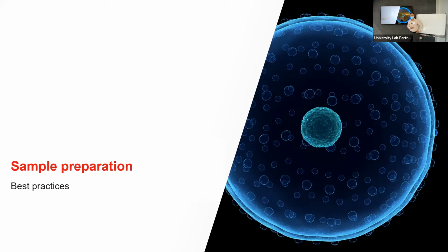I think it's not complicated, but doing it every day, you can get the expertise in cell sorting. Yeah, definitely. The user has been doing it over the last 15 years or so. It takes a few hours to give us sorted cells. Exactly. If you purchase one, then you have to have somebody expert in that. That's going to be double the cost. Yep. You need a person to go along with it.